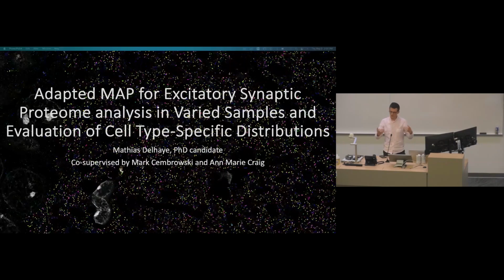The experience with this technique, and also expansion microscopy, is that even though the principle is quite simple, it's quite hard and requires a lot of troubleshooting to put it in place reliably and reproducibly, especially with the initial protocols as well as the paper that was published, because it was not very detailed and not very adapted for non-bioengineers. So I spent quite a bit of time trying to adapt this procedure for the study of excitatory synaptic proteins.